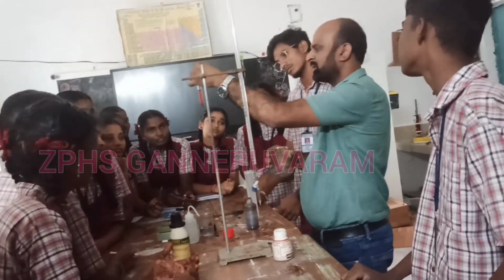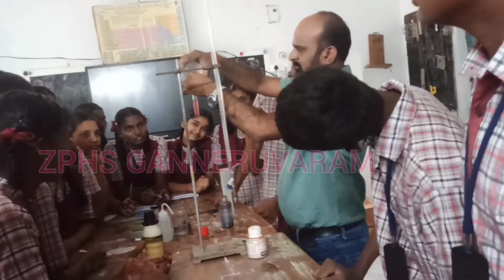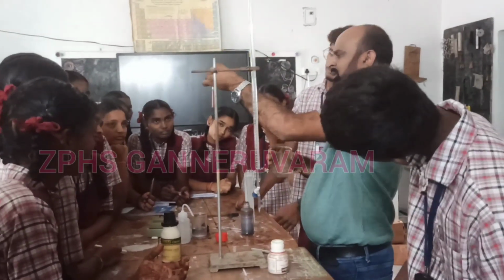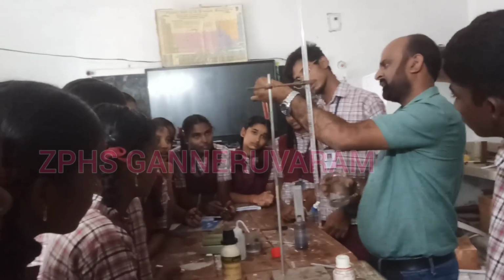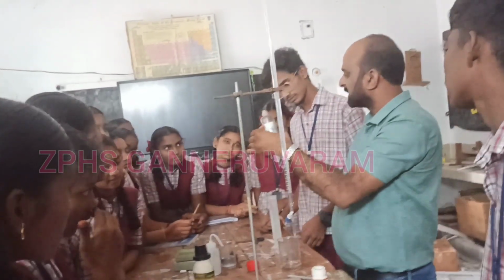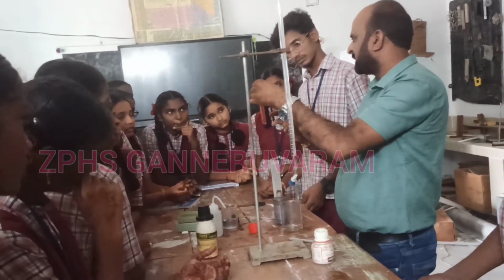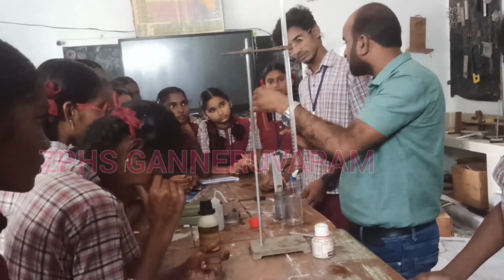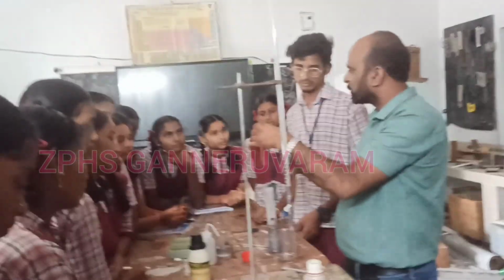The color changes to what color? Red color. So why is the red color obtained? Because red litmus is a red color. And the reaction takes place. What reaction takes place here? Neutralization reaction takes place.